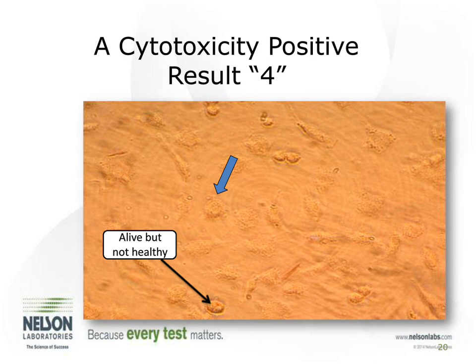And so we really have almost complete destruction. There are a couple cells there that may still be technically alive, but definitely are not healthy. And one way we know this is because we stain the same slide with that neutral red stain, and as you can see, only a couple of them even have any red in them whatsoever.